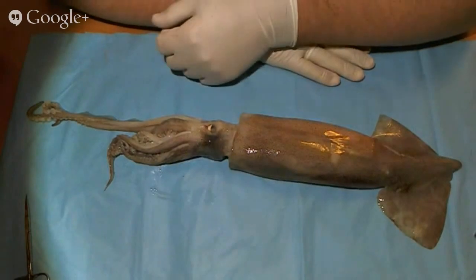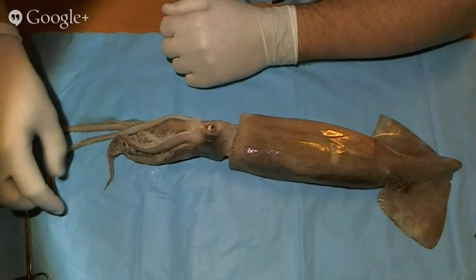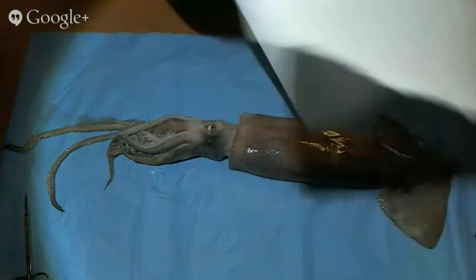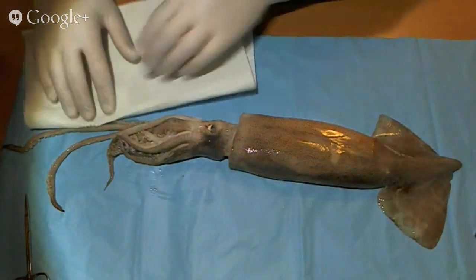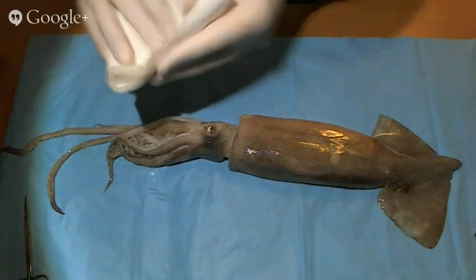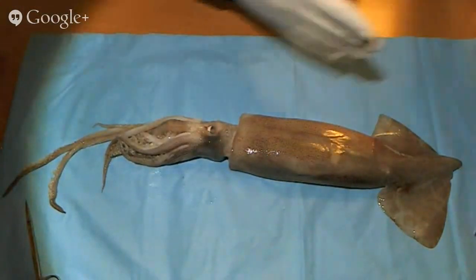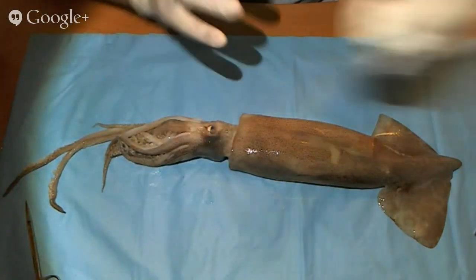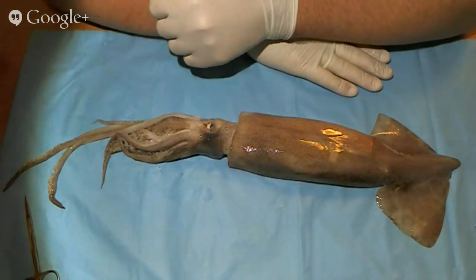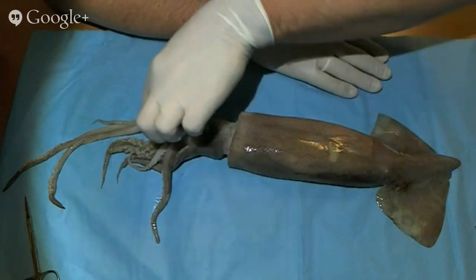One thing you've got to think about is that everything that's alive, no matter what it is, has been discovered to do 5 things. It will move, it breathes, it grows, it reproduces, and of course I'm forgetting the 5th one. So we move, grow, breathe, reproduce, and if anybody wants to chime in, I'll remember the last one in a little bit. So we want to look at this animal. How is this animal moving? What is this thing doing to help itself move?